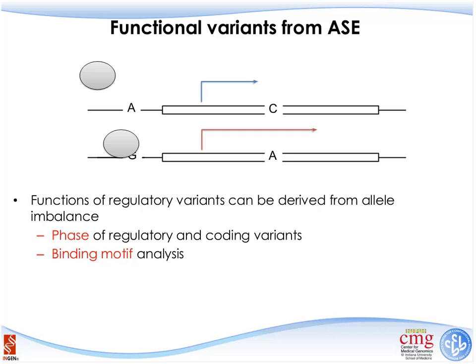And we know that from the RNA sequencing data, we can only measure the variants in the transcript region. So the heterozygous variants in the promoter region may not be measured, even with DNA sequencing. And if the two variants are pretty far away from each other, we may not be able to measure them very effectively. So phasing is required in order to proceed with this type of study.